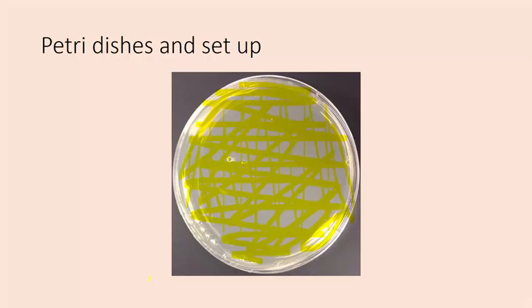Basically, the antibiotic discs are pieces of paper that have been soaked in an antibiotic. And so in this experiment, what we did was add 4 antibiotic discs, and they stick to the petri dish. So each of these 4 circles represents a different antibiotic. And then what we do is place this petri dish with those antibiotic discs in an incubator for 24 to 48 hours and allow that bacteria to grow. So what I'm going to show you next are the results of those petri dishes.